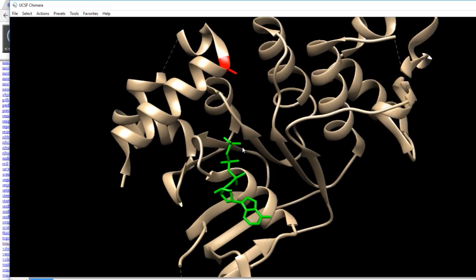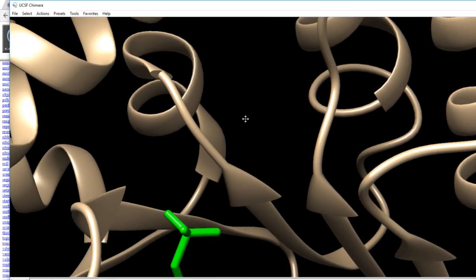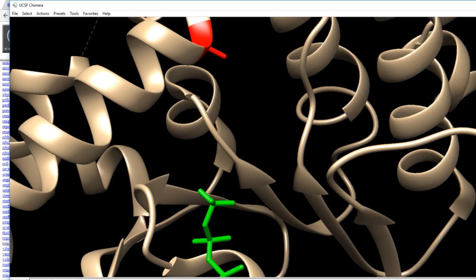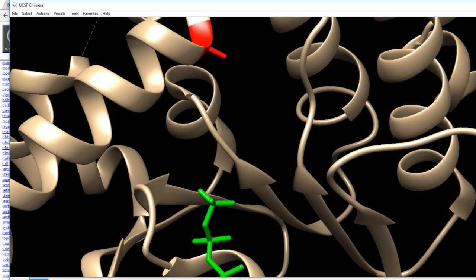I'm then going to zoom in and drag just a little. That's probably a bit too zoomed in. That's better because I want to see the alanine up there in my video. Click out just one more there. And now I'm going to save that position as pos2. What was pos1? Well, I can do that by reset to pos1. I'm back to pos1. Reset pos2. I'm back to pos2. That's pretty cool, isn't it? I can just jump between saved positions.